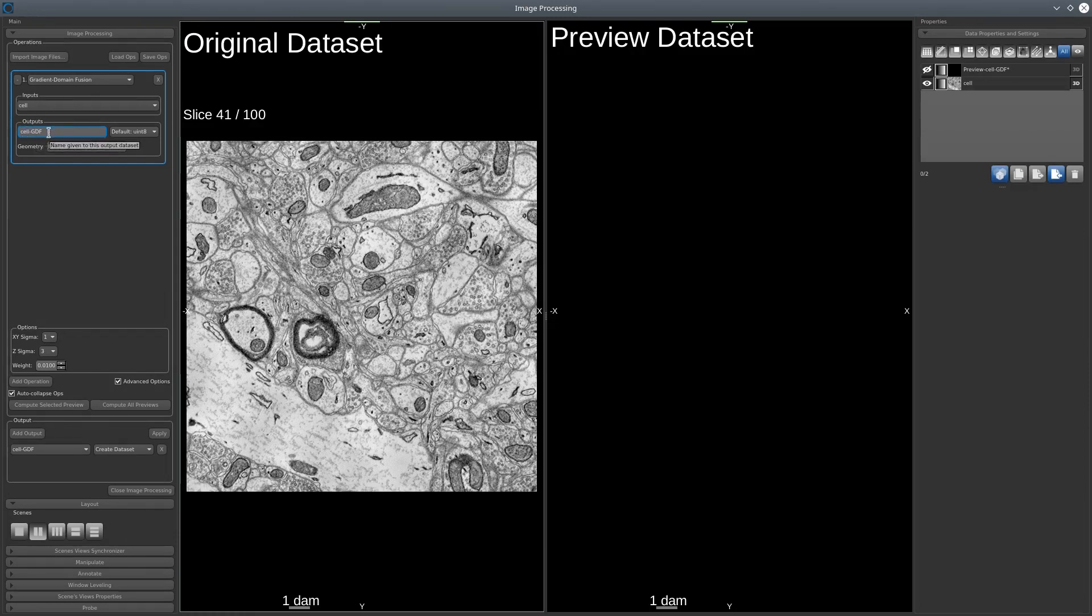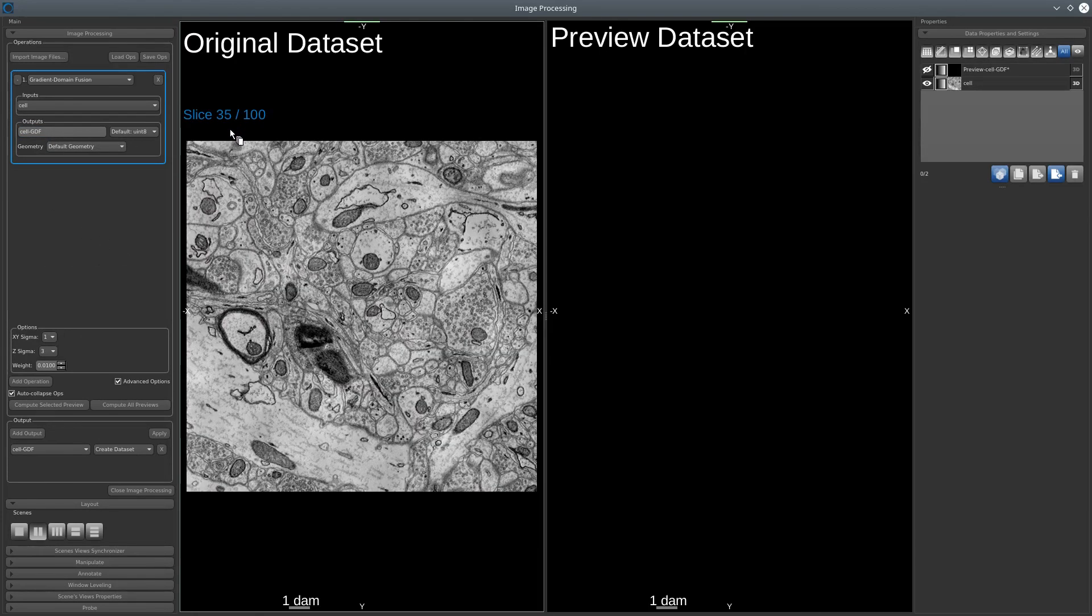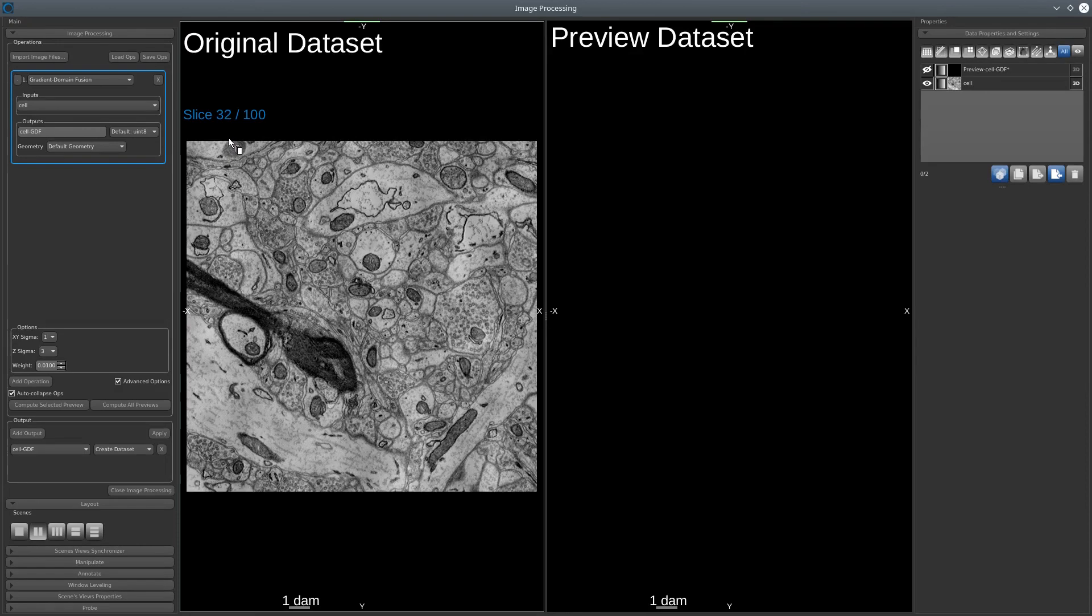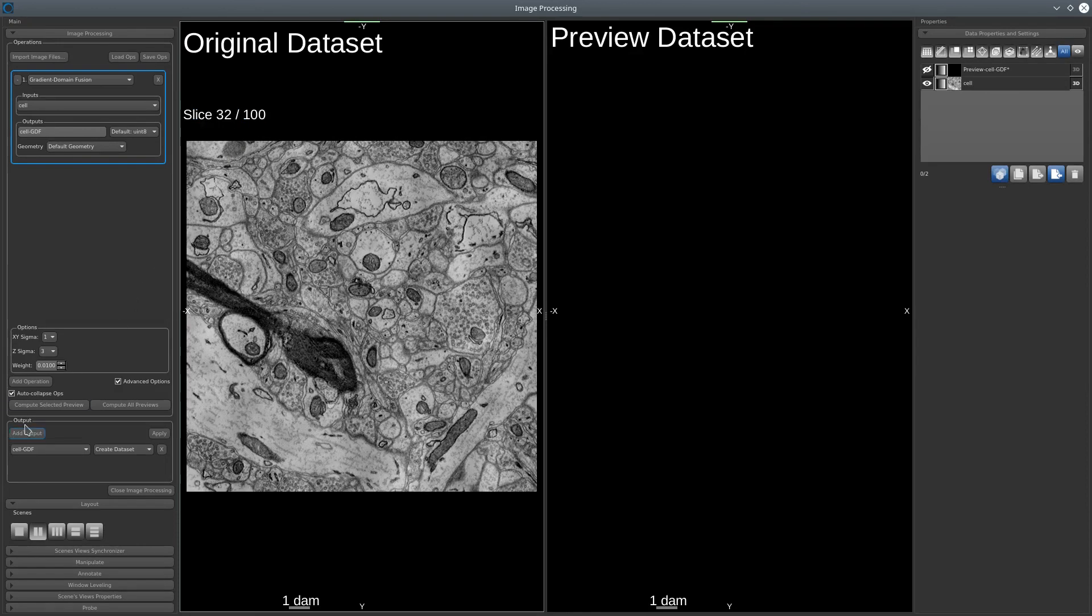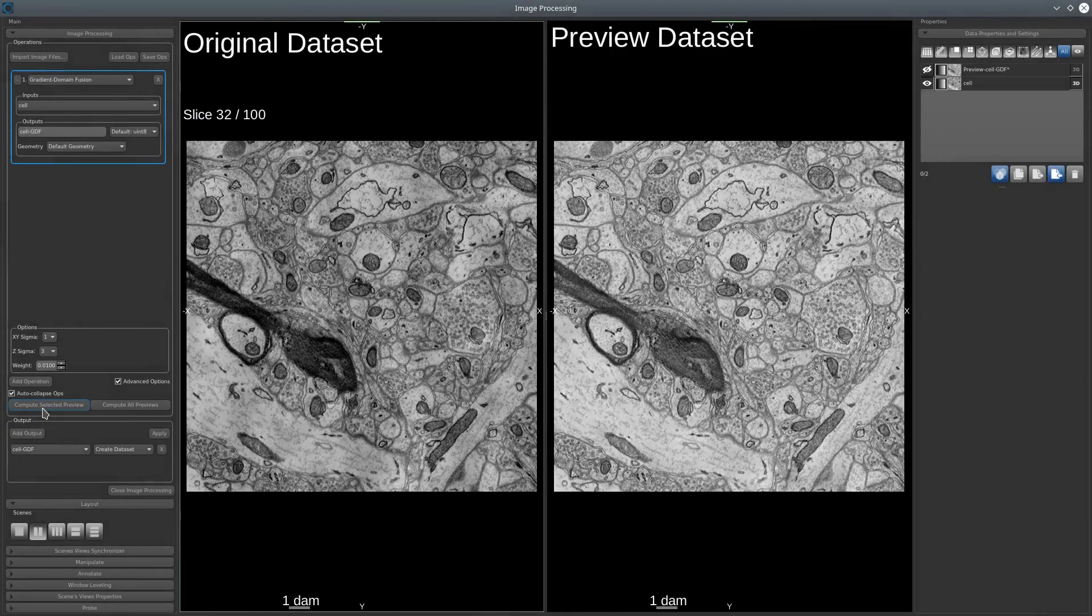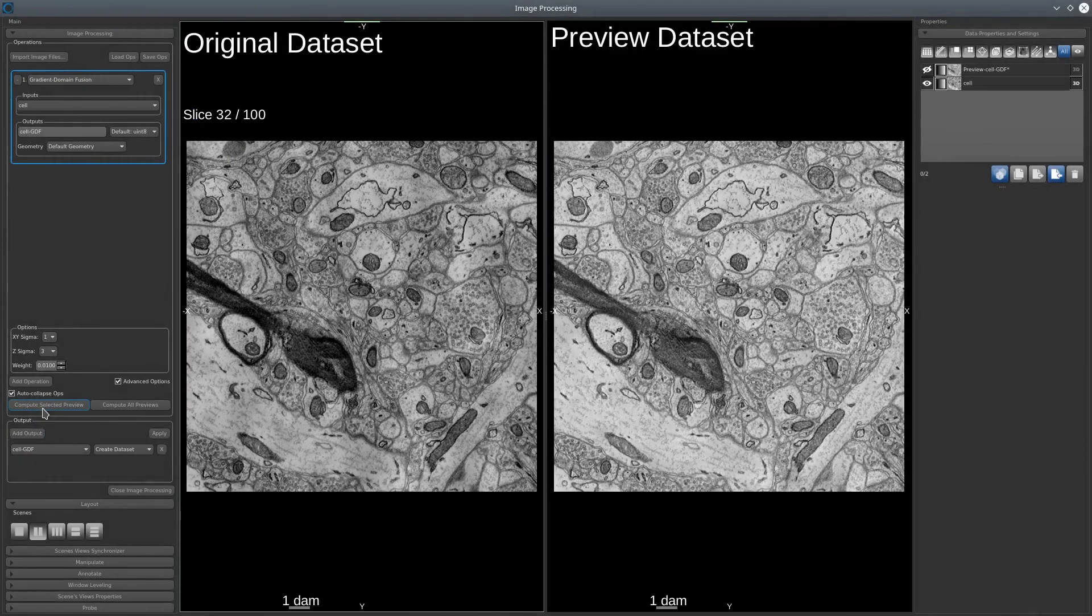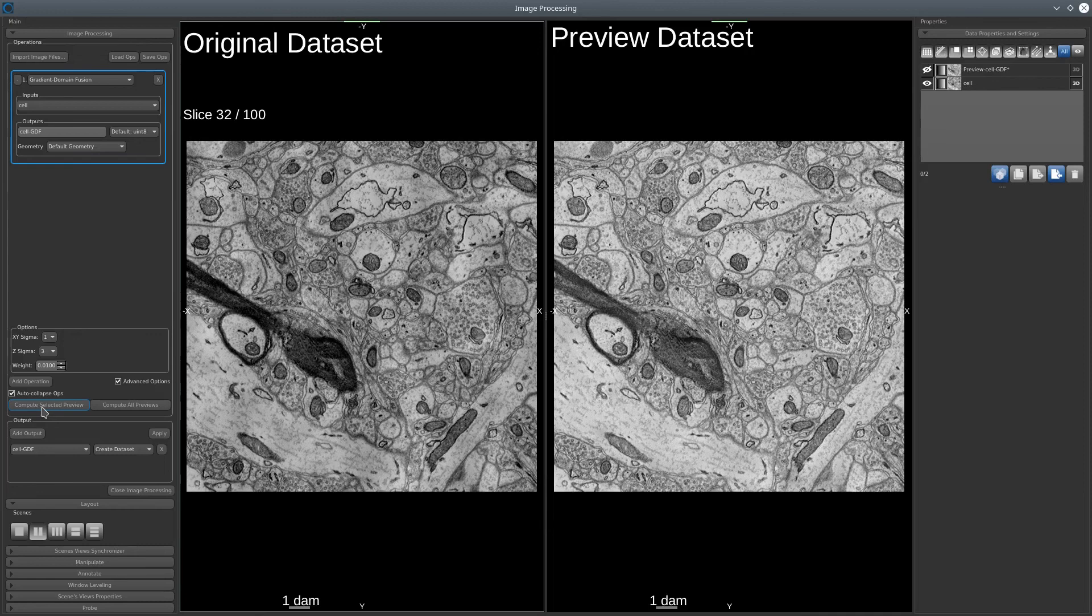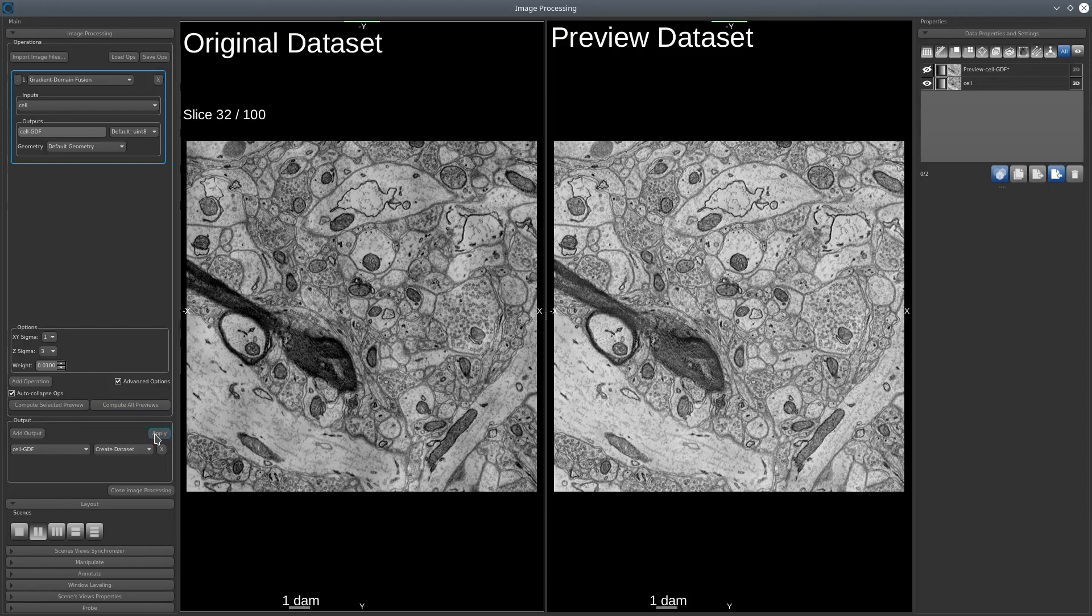To correct that artifact, we can select a slice and then compute selected preview. We can see that this is right, but we'll have a better idea of the result since it's on the full stack. So let's just apply the whole thing.